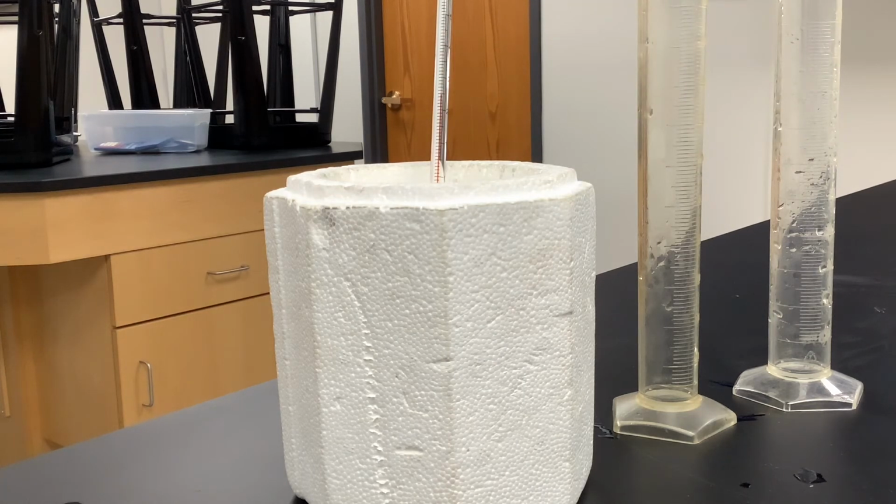As we wait, you can think about sources of error, anything that affects our data collection, affects our final results, that makes them less than accurate. For example, this assumes that no heat is lost or gained from the environment. Is that accurate here? Could some heat be lost during our transfer? Could our calorimeter not be perfectly insulated? So is there some heat transfer between the calorimeter water or the metal and the environment? Are there other sources of error involved in this lab as well?